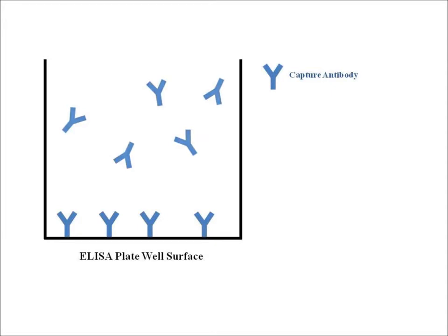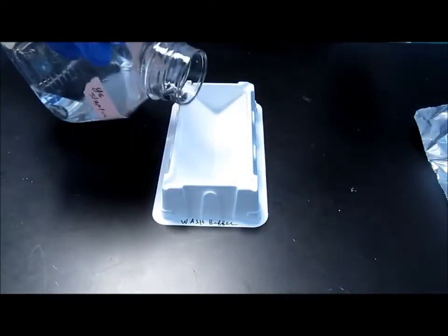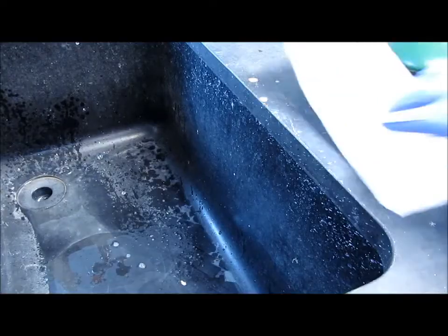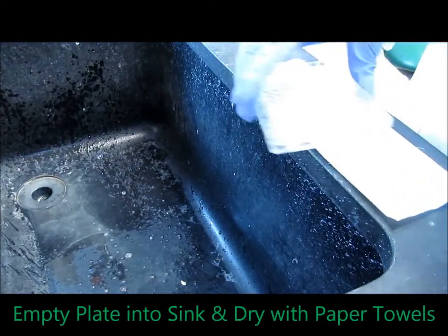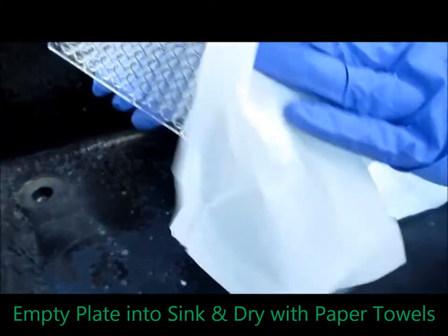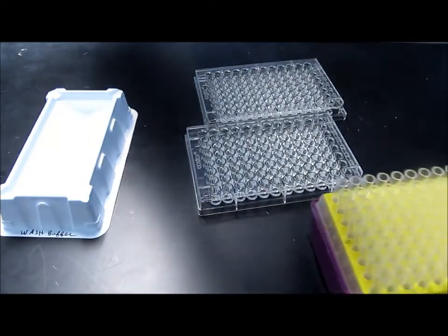The next day, we're going to wash our plate 3 times with PBS in order to remove any unbound capture antibody from the wells of the ELISA plate. In order to do this, you're going to need some wash buffer, which is just PBS with a little bit of detergent called Tween 20. Fill up your reservoir, and then take your 96 well plate, and with a forceful thrust, empty out the contents into the sink and blot it against a paper towel. I like to wipe away any residual drops with a Kim wipe so that I don't get my gloves wet.